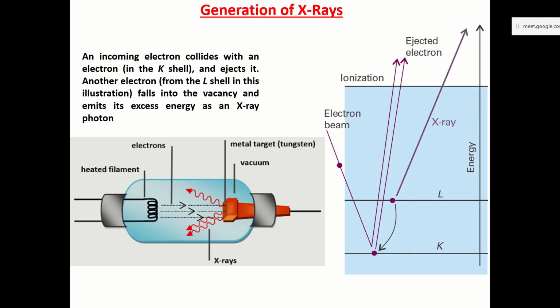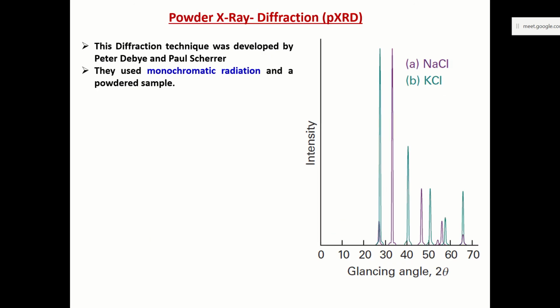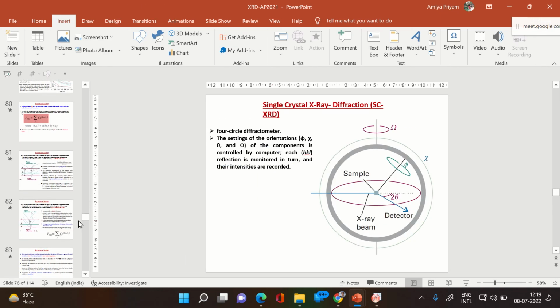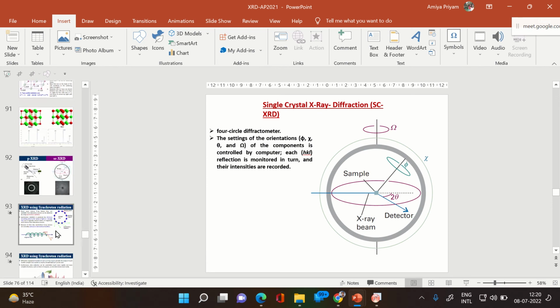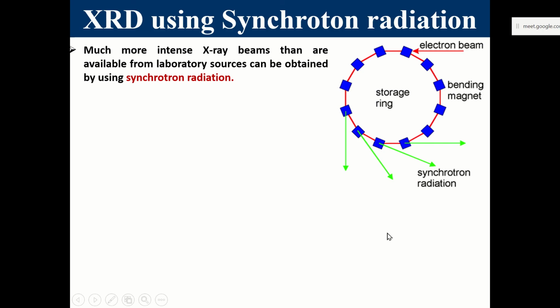But sometimes it is the X-rays, you might think of having X-rays of different wavelength, and that may not be possible to do with this particular system. Then we need additional sources of X-ray, and for that we have to rely on something called synchrotron. Synchrotron is a setup which is very, very big, huge. It's almost like a football field or something like that, you can say.